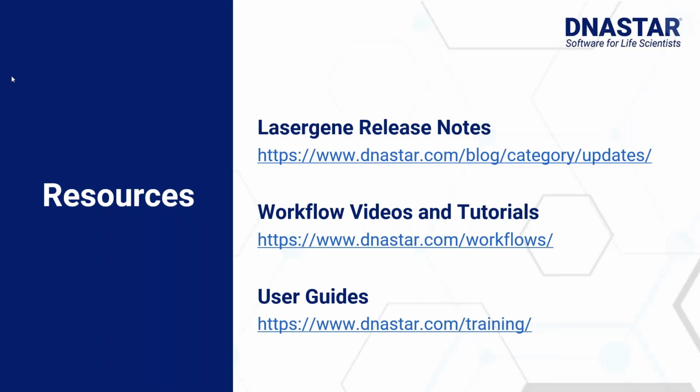It does, yeah. Those were RNA-seq assemblies that have been run through the SeqMan engine wizard, and DESeq2 was chosen for the gene expression calculation. What the wizard does is run the assembly and then send the information up to the cloud, which is running an instance of Bioconductor with DESeq2, and that calculates the actual differential expression.